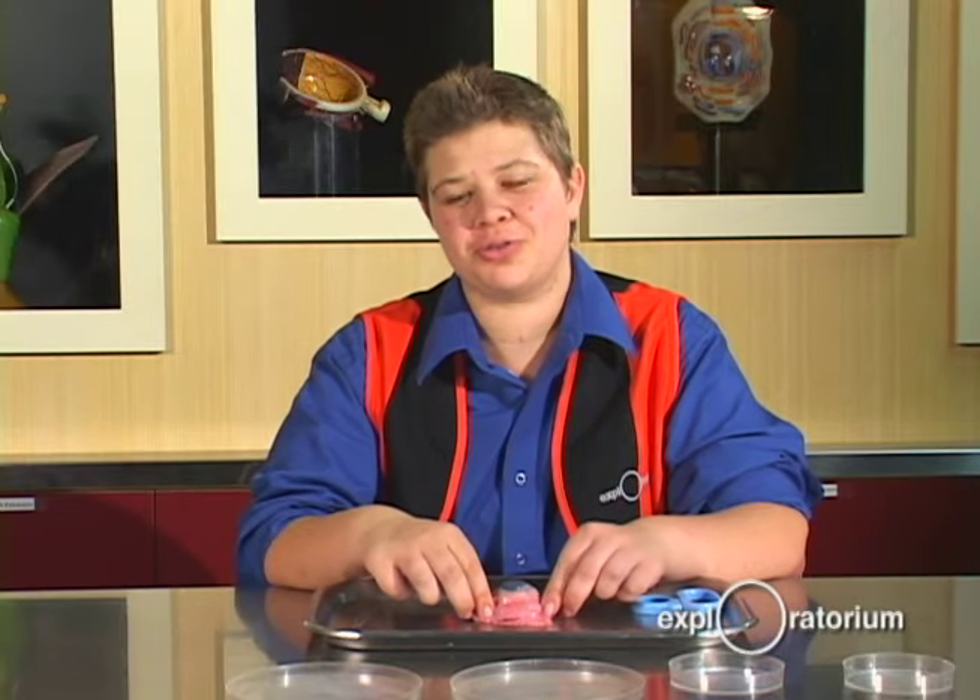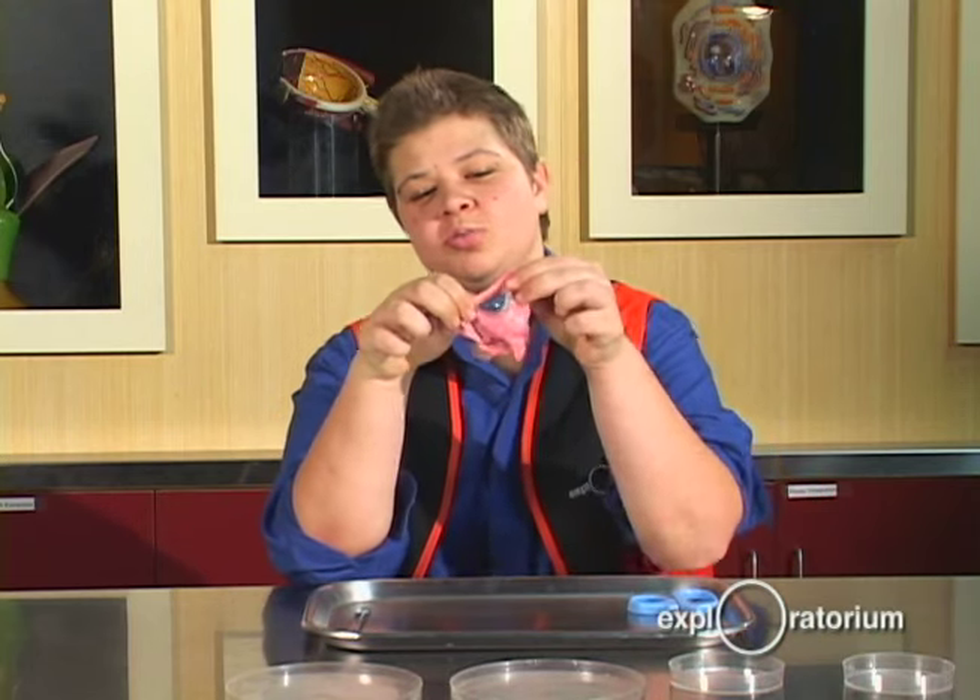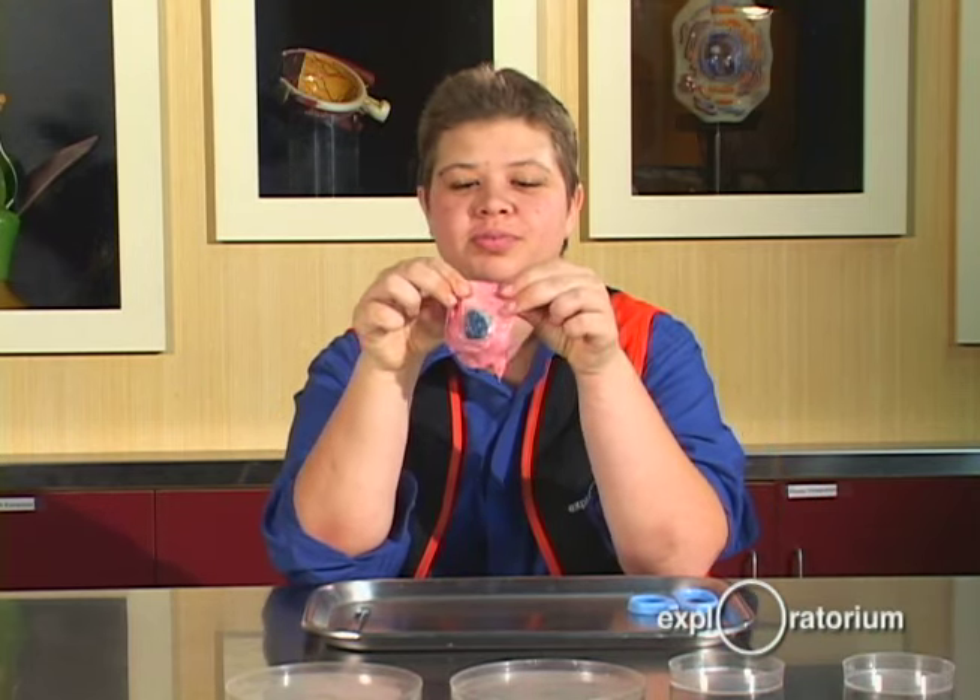And now what you've all been waiting for — the cow eye. This pink and white part that I'm holding is fat and muscle.